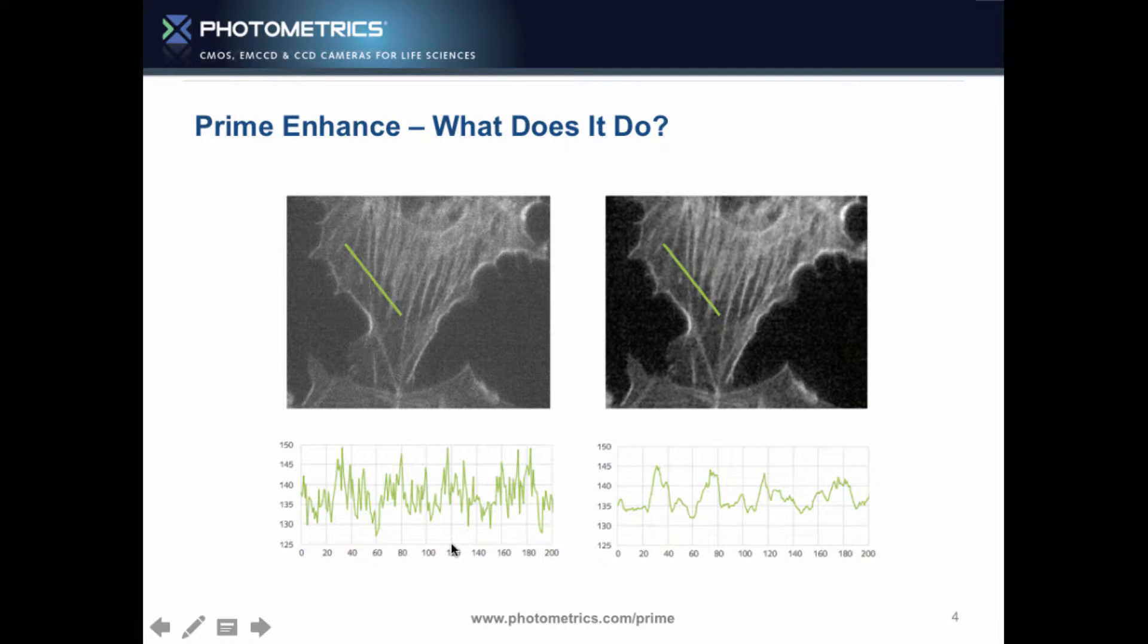Okay, so let's have a look at the Prime Enhance. What are we doing? We're moving from a situation where we have a large amount of noise and reducing that noise with the same exposure time. And critically, we're keeping these intensity levels all the same.